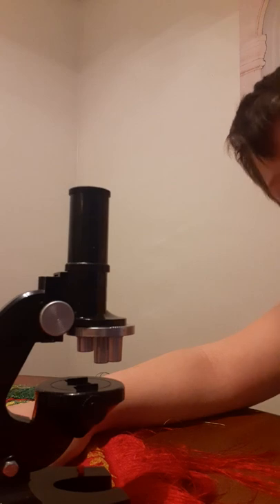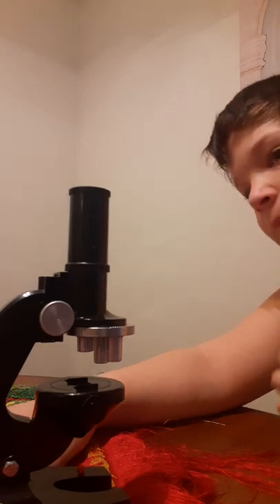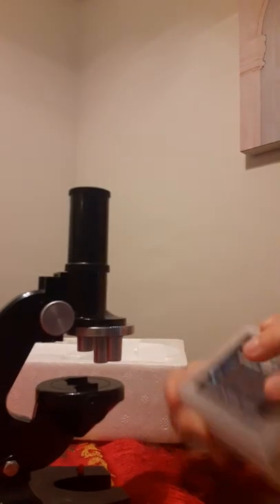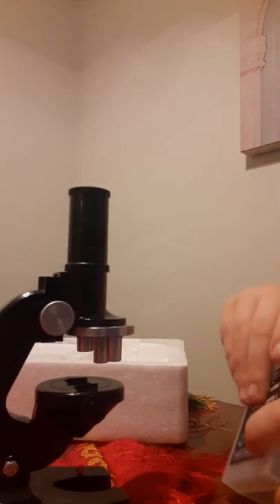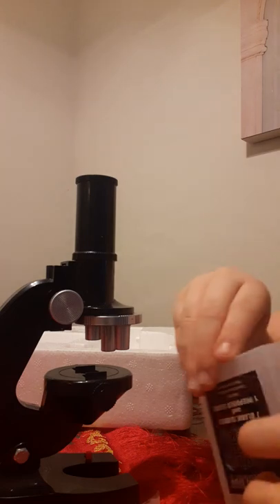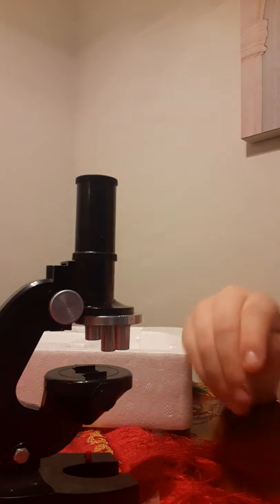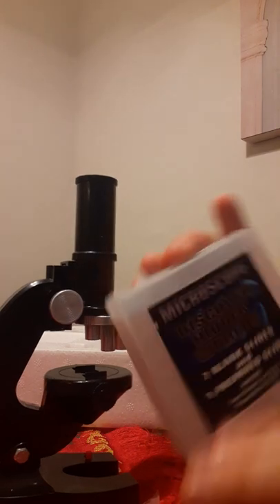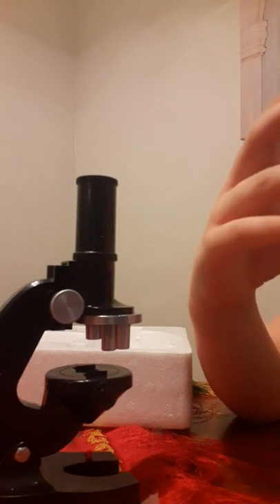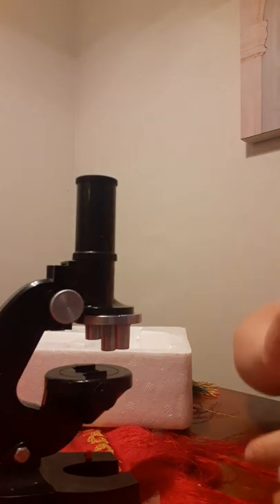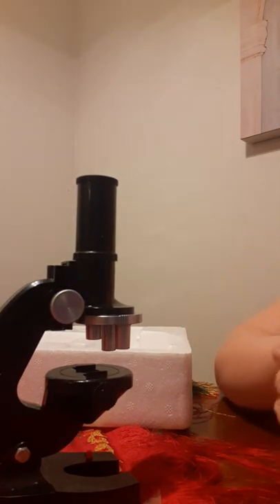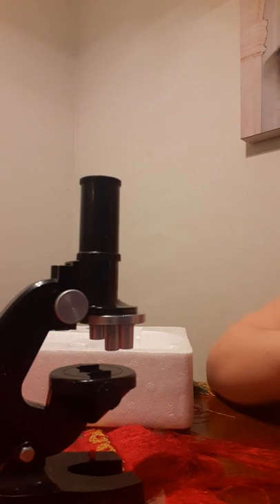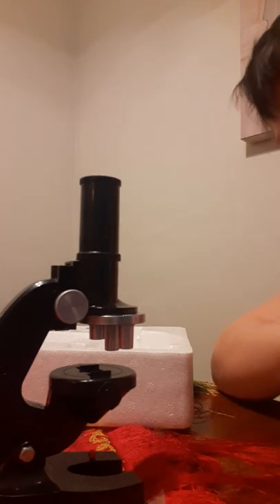Okay, glass slides. They come in this little container. Wait, okay, it's still filming. So basically it comes in this little container. It has seven blank slides and one prepared slide. So this is a powered one.